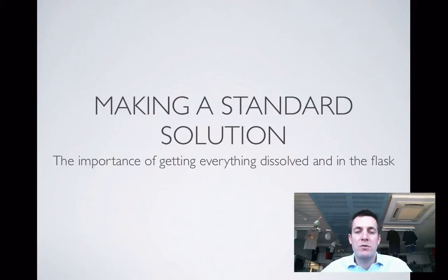It's the first of a number of practical films, which I've put in the acids and bases topic, but these techniques are just as important in the redox topic, really. Although these films will concern an acid-base reaction, it's important to realize that these techniques are not confined to the acids and bases topic.